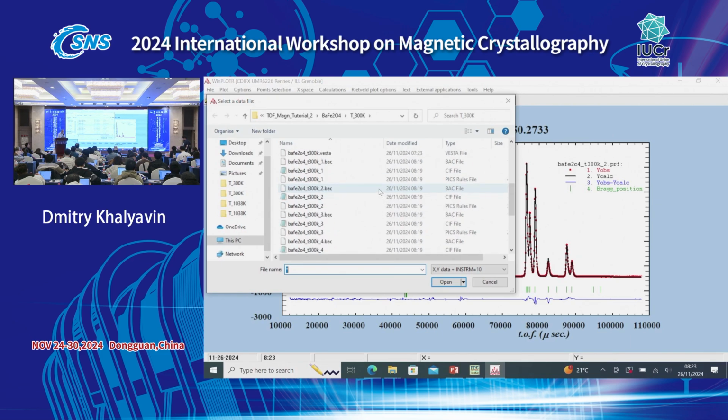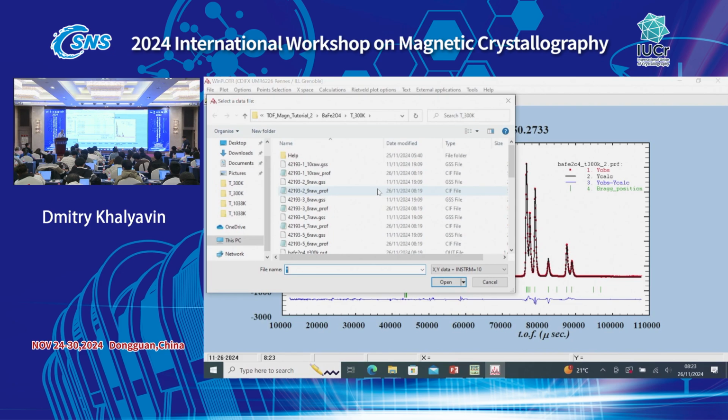Well, I don't remember. But you can look at the magnetic component, the purely magnetic component. Right. But you need to turn that on first. No, I mean, I usually do subtraction in order to do that. No subtraction. There is a model calculation. You mean model? The model, this is just to see how big are the peaks.